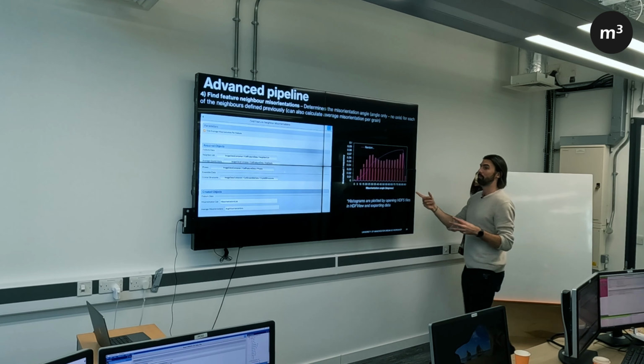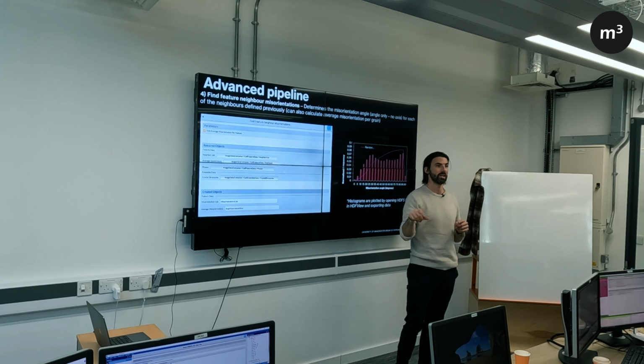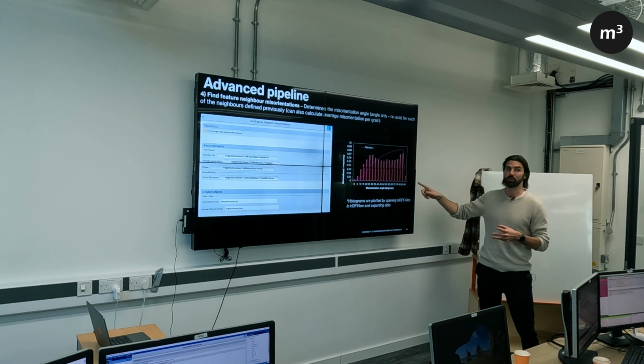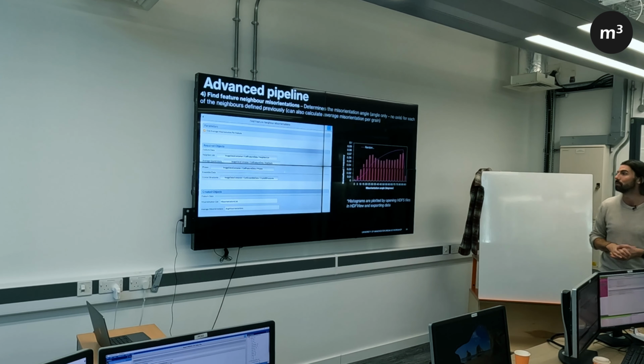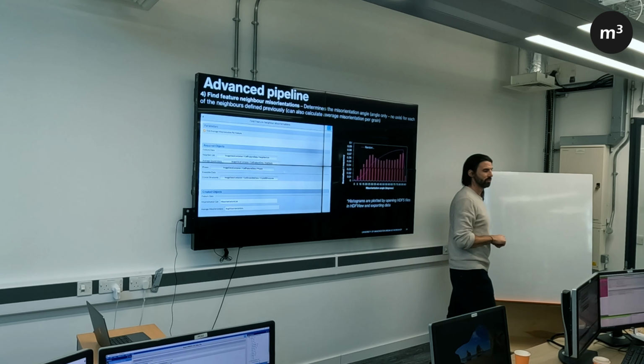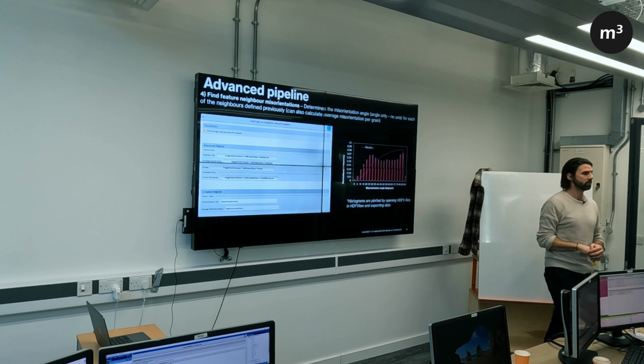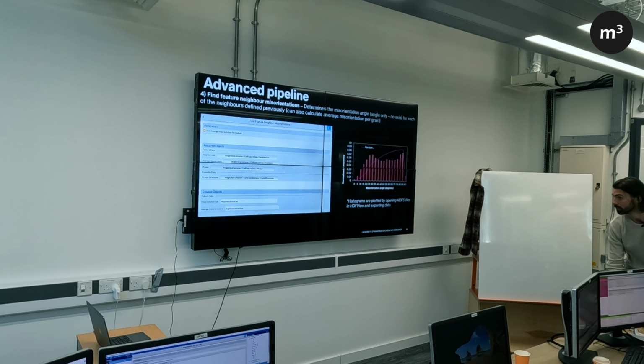So if you would then want to do some post Dream 3D analysis to properly analyse that boundary, you do have the orientation data of each grain as well. But this is just the misorientation, which is a simplified view of the grain boundary. It also does the average misorientation, which I don't really know if that's very useful. So that's the average misorientation angle between that feature and all the surrounding features. Don't know if that's useful. I don't think so. But if you're not interested in that, you can just uncheck that box. But what we're really interested in is this misorientation between that grain and all the adjacent grains.